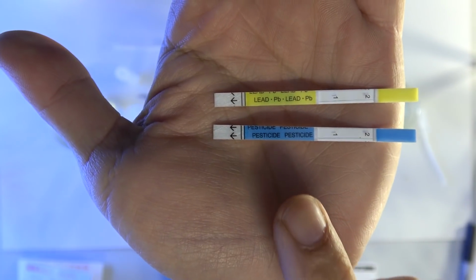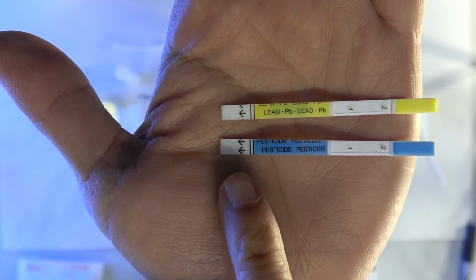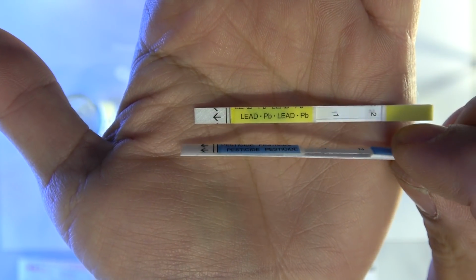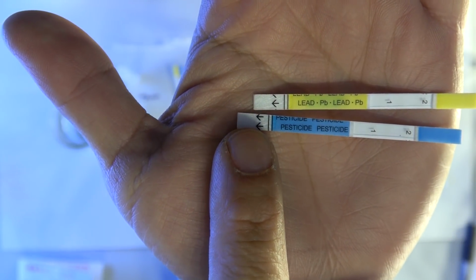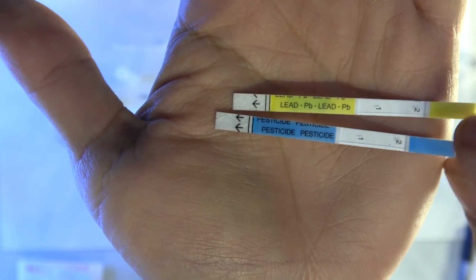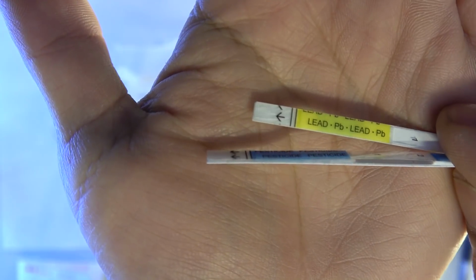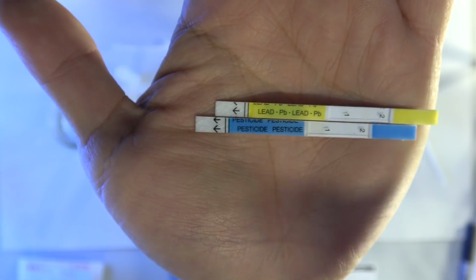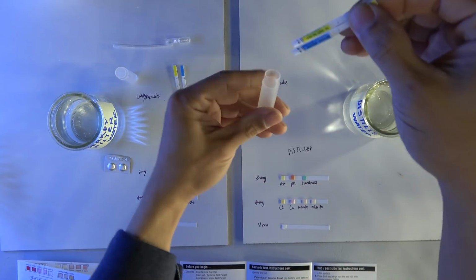Now take a look at the test strips themselves for the lead and pesticide. You've got the side with the arrow, and I guess when you put this down, only this part is submerged in the water, the arrow part, and then it's going to suck the water up all the way up here. It looks like you've got some cotton material in here to suck it up. Alright, so this arrow part goes down so that it can suck the water. So here we go.